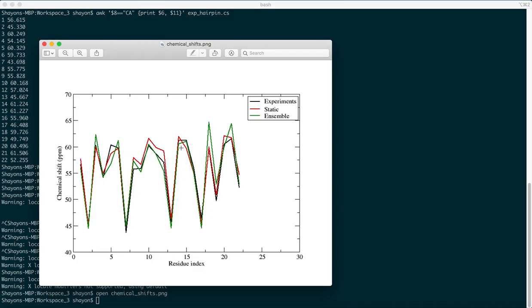So you can employ other statistical methods like regression analysis and correlation coefficients in order to find the degree of fit of the predicted chemical shift values with that of the experimentally assigned chemical shift values. Okay, so SHIFTX2 is a very efficient program in that regard to predict the chemical shift from a PDB structure, in this case, the beta hairpin of alpha-synuclein bound to an Affibody.